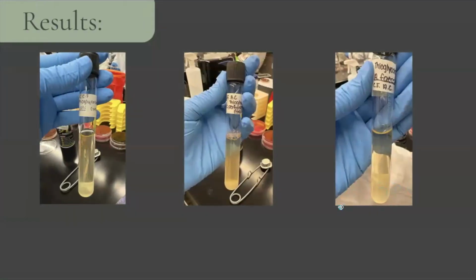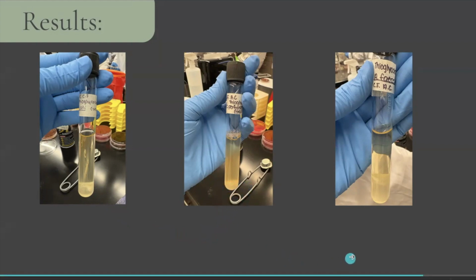For our thioglycolate mediums, E. coli, we see on this side had growth and it should have been top heavy. We see it more at the bottom, but it should have been a facultative anaerobe. For C. perfringens, we see growth only at the bottom right here. And that's the obligate anaerobe.